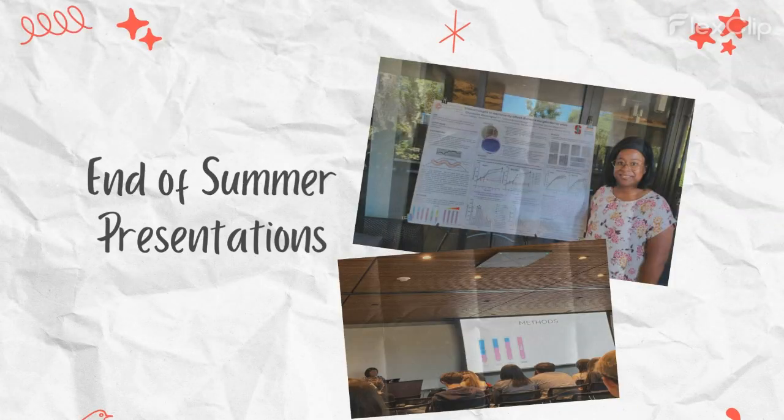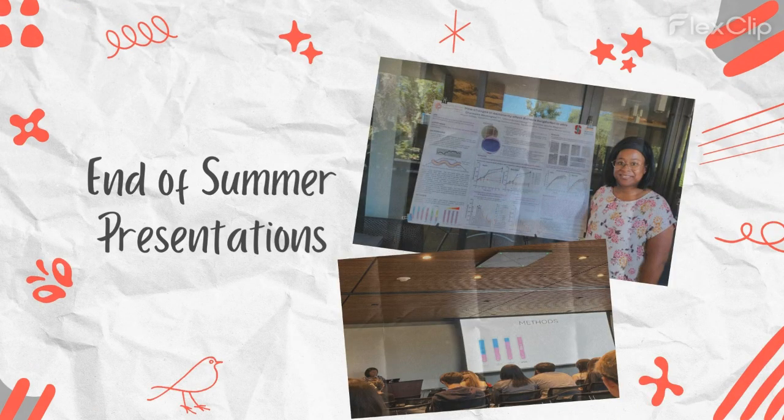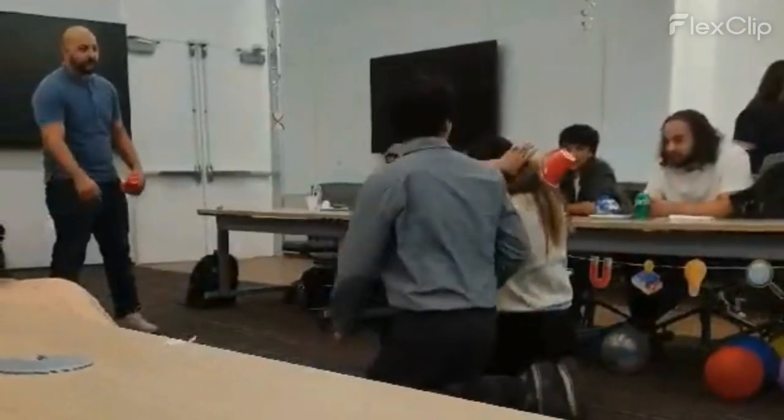I just got back from my meeting, and now I am counting the colonies that my bacteria formed via plating. Then finally, I presented my findings to a group of scientists and students. It was a great opportunity to share my work and get feedback.